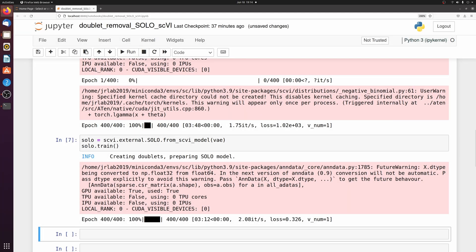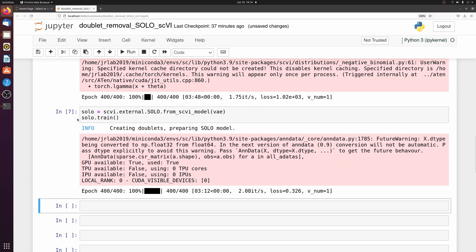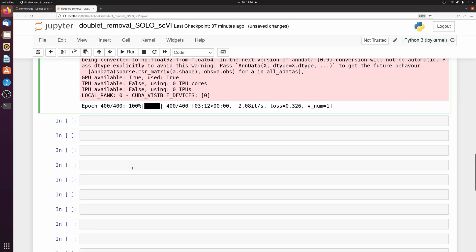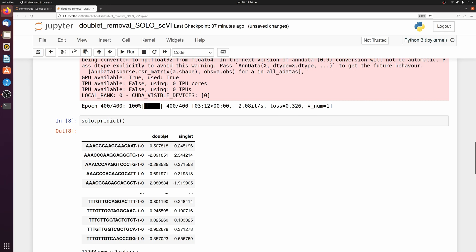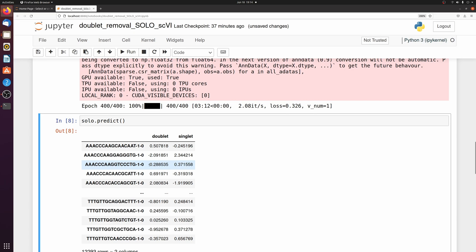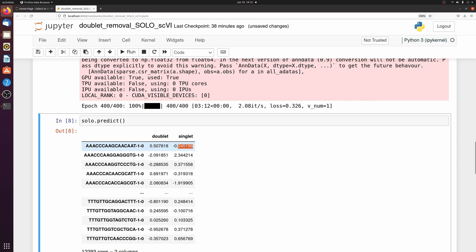So after that's done we can call this solo object, solo.predict, and it returns a dataframe with the doublet and singlet prediction values. These probabilities aren't on a scale of 0 to 1, but basically if the singlet prediction is higher than the doublet prediction, then it predicts that it's a singlet. If the doublet value is higher than the singlet value, then it's called a doublet.